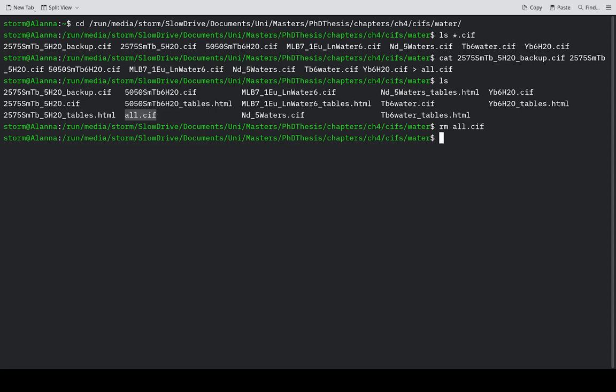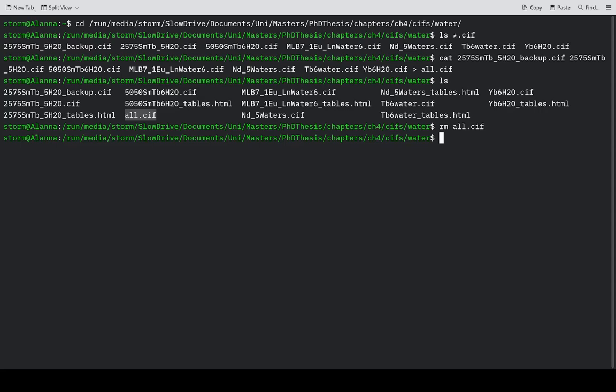if I have a pre-made CIF file with my x-ray settings and the hardware description of my x-ray, my name, the authorship information, I can make sure that goes up first. And I can also make sure the order of the structures in the CIF matches the paper.